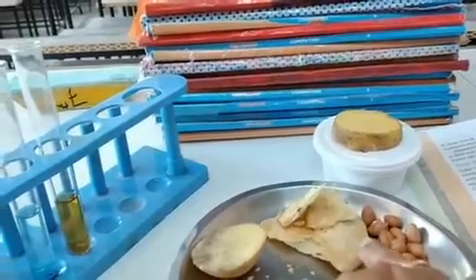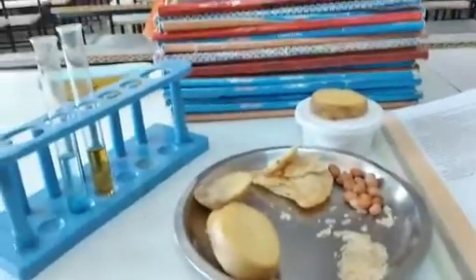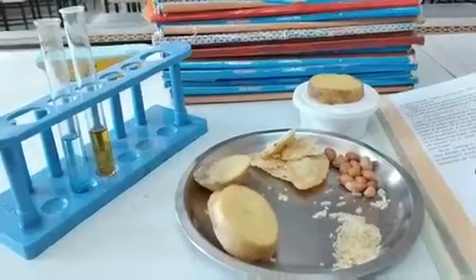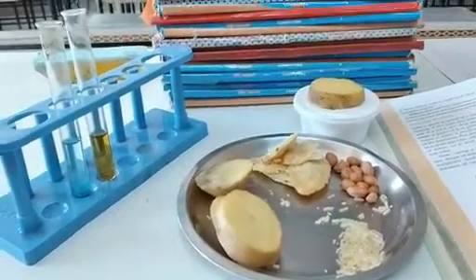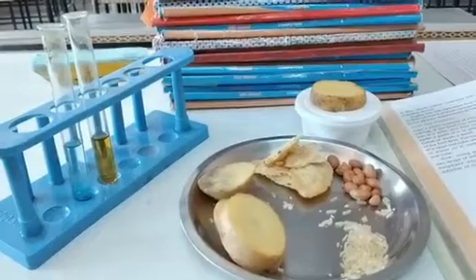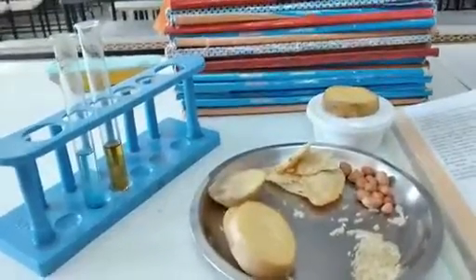I have taken puri which is fried one. So these are the materials I have collected and I am going to try out three activities to show which food item contains fat, which food material contains protein and which one has starch in it.